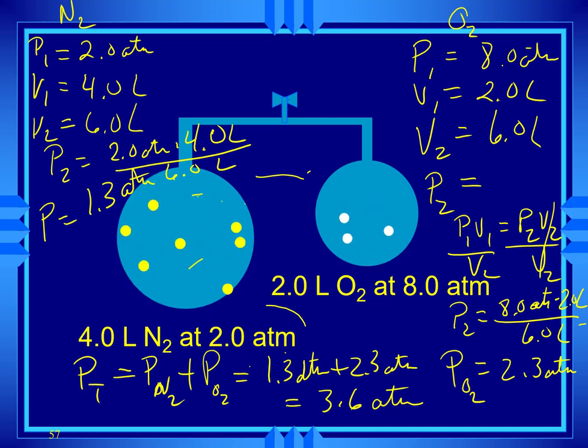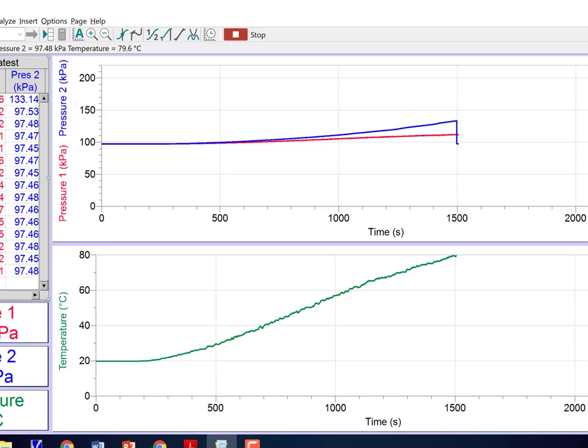Oops. Well, I guess we're done collecting data. Man, what happened? Well, pressure got high enough that it popped the popper off.